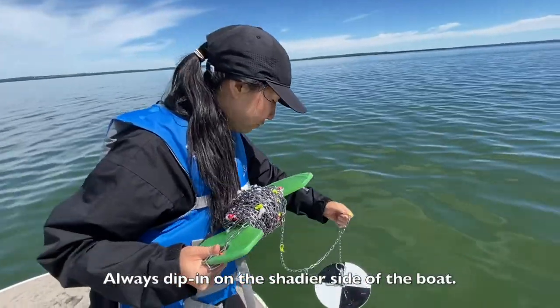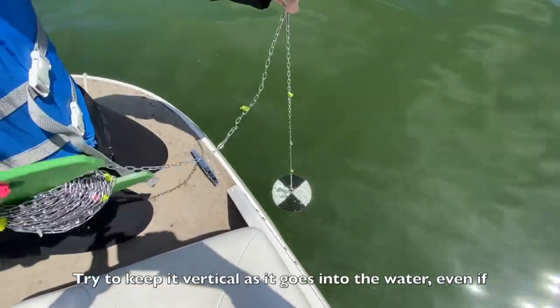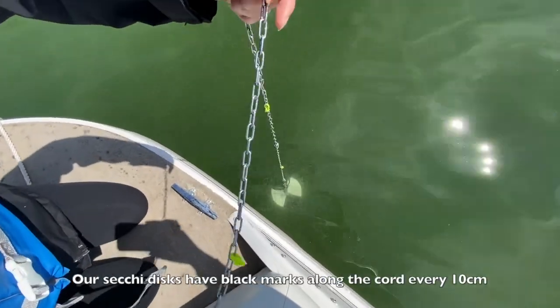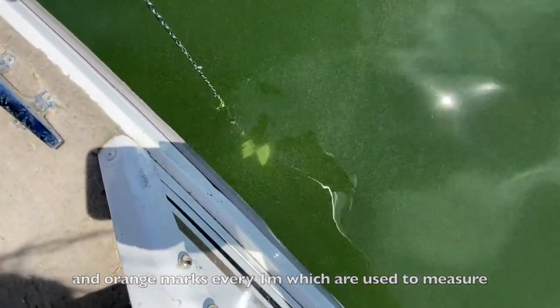Always dip in on the shadier side of the boat. When you are ready, slowly lower your disc into the water. Try to keep it vertical as it goes into the water, even if conditions are windy or wavy. Our Secchi discs have black marks along the cord every 10 centimeters and orange marks every one meter, which are used to measure the Secchi depth.